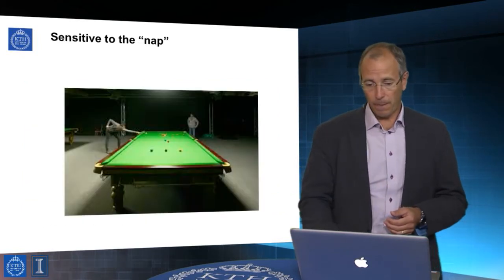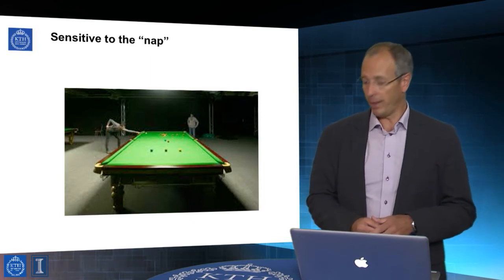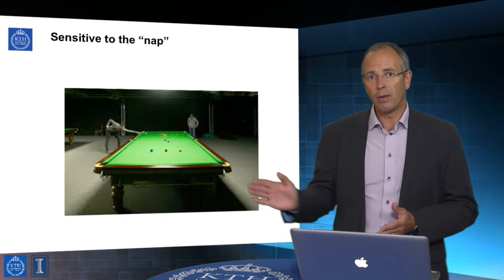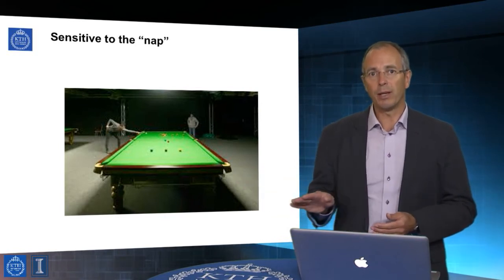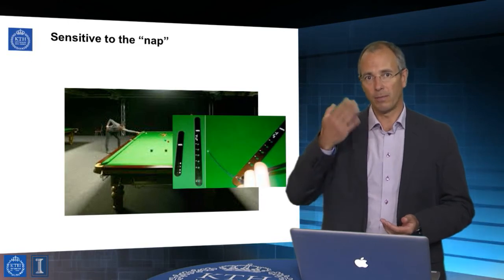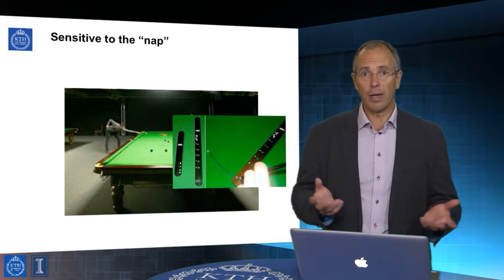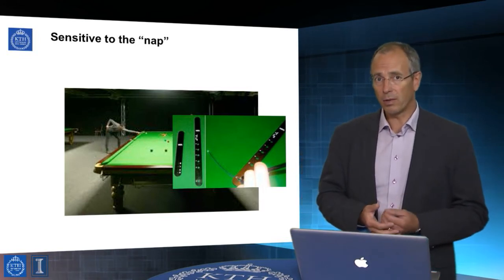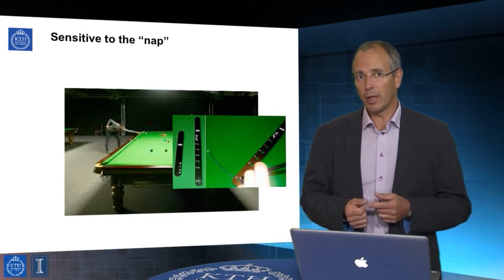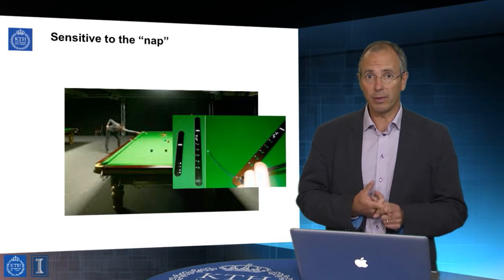And it's analogous to the nap on a billiard table, or indeed on the surface that we have here, that rubbing your hand in one direction gives you a completely different friction than in the other direction, because it depends on which direction the fibers are oriented. So that revealed a wealth of structural information that would have been absolutely inapparent by any spectroscopic techniques or by topographical imaging.